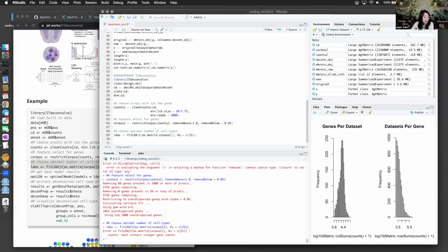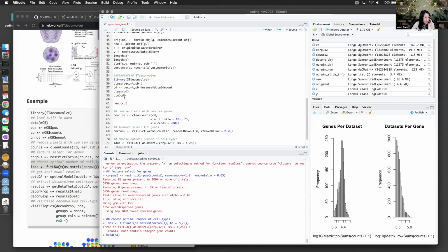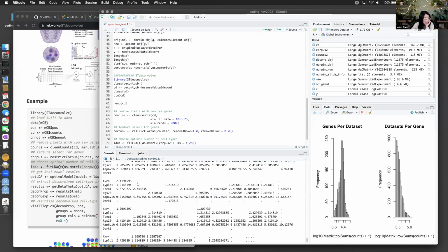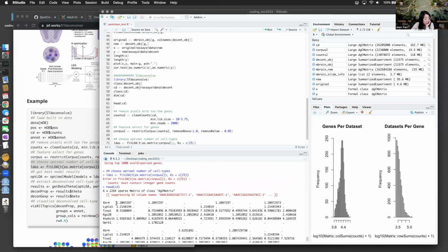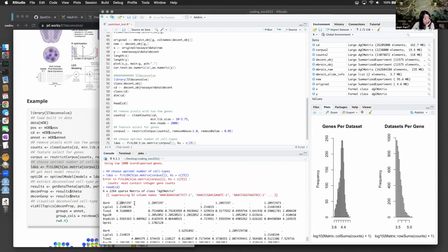Actually, I never checked what the values are in this CD. So in this spot we have 1.2 of this particular gene. I don't really know what that means, but for me, we should only have like 1 gene or 2 copies. In theory, we could scale it up, multiply by some large number, so then instead of 1.2, you would have 12.